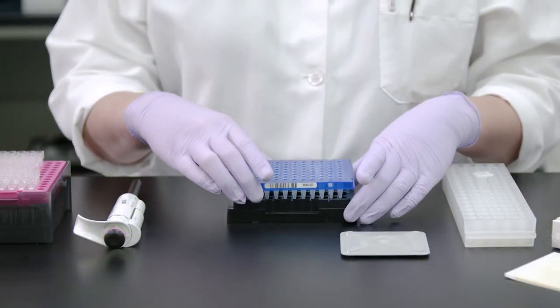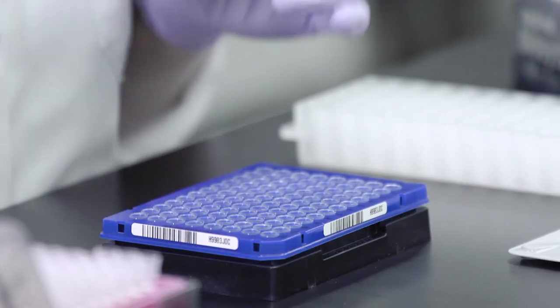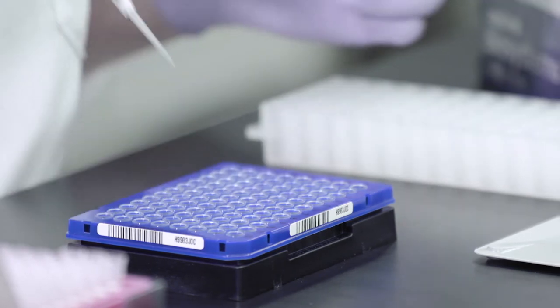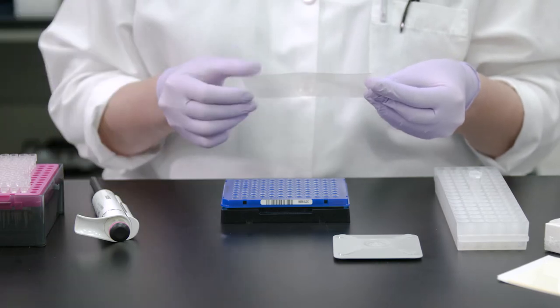To begin, place your PCR reaction plate in the plate rack. After pipetting your PCR samples into each well, remove one of the adhesive plate seals from the package. Remove the backing of the adhesive film.